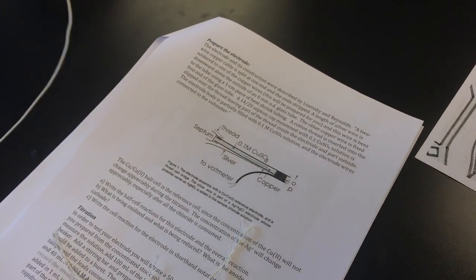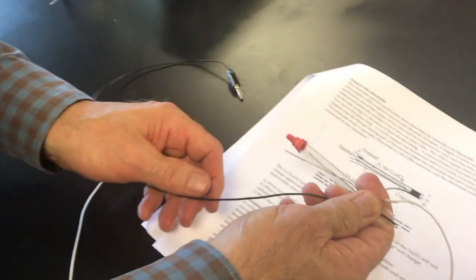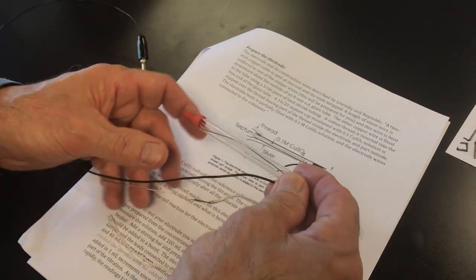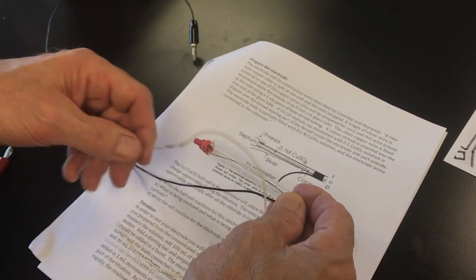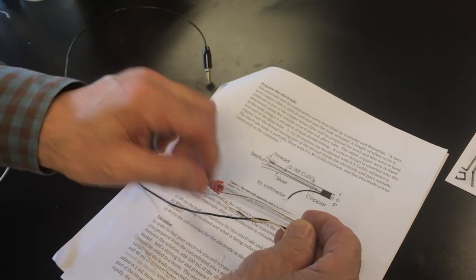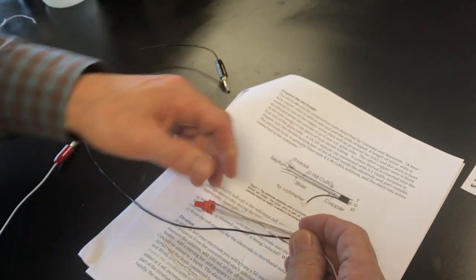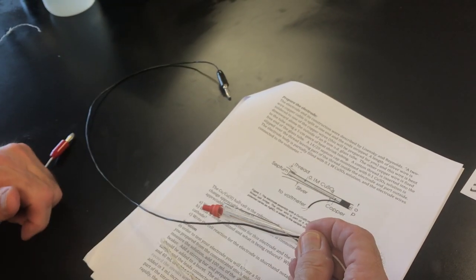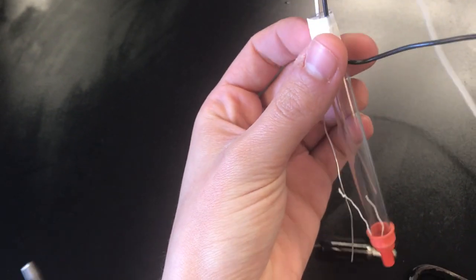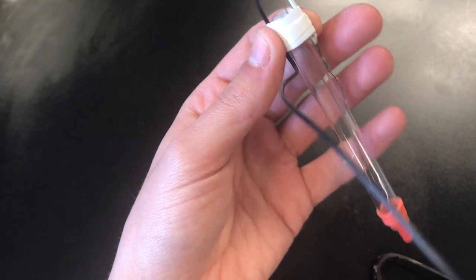This is what we're trying to do: the septum here, the copper goes inside, the silver goes outside and contacts the solution outside. We just need to shrink-wrap it on top, and that's our electrode. Make sure that your electrode all stays together — we just put a piece of tape around the top to hold it, but you can also use shrink wrap and a heat gun to make it stay.